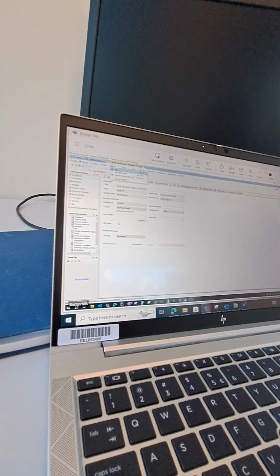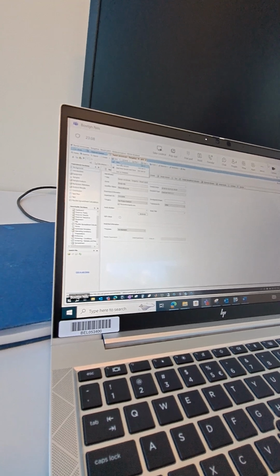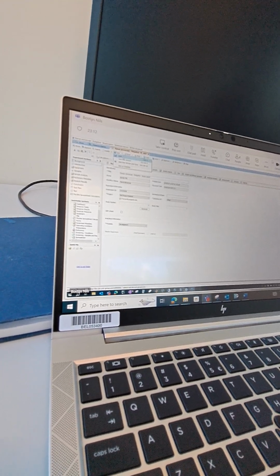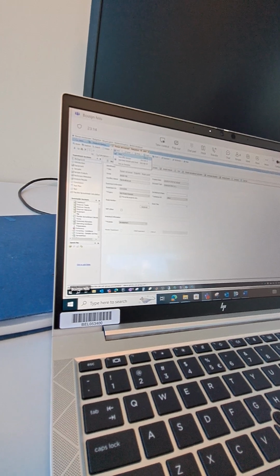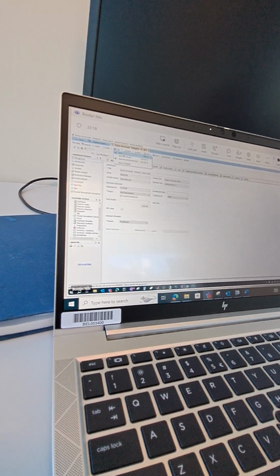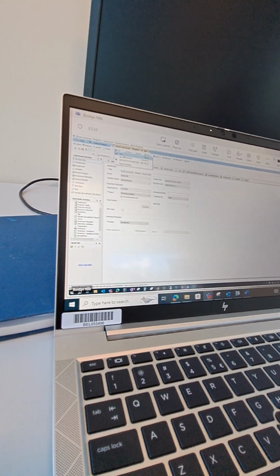You will use the form. I don't know, will you do it on multiple days? It's not necessary to make one ELN per day. You can make one ELN that you use to describe multiple days.